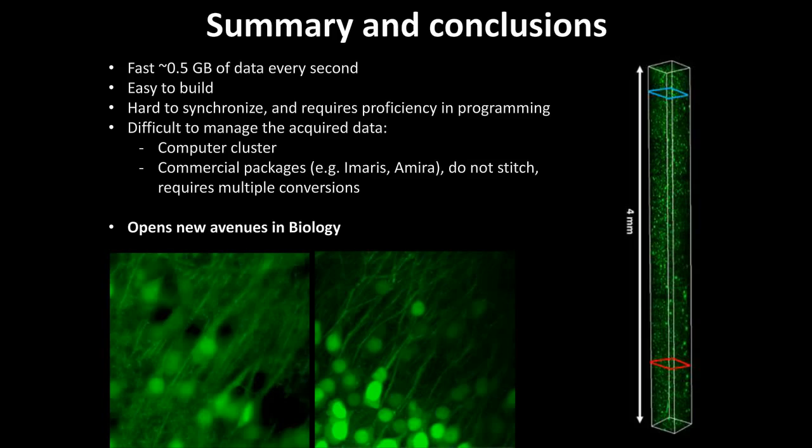You can see very large volumes with a very high resolution and in 3D, and that allows you to look for very rare morphological events.